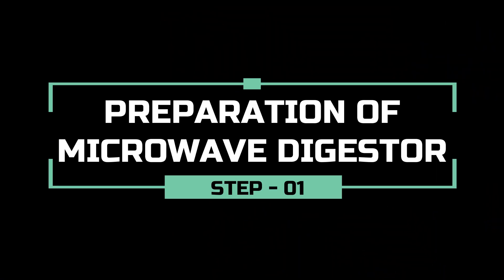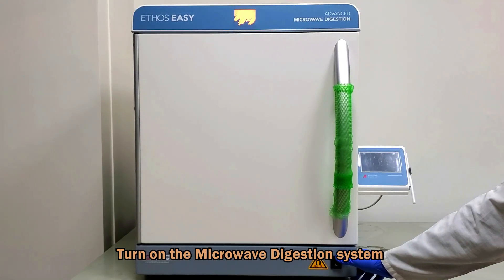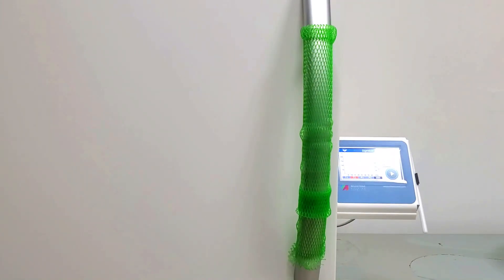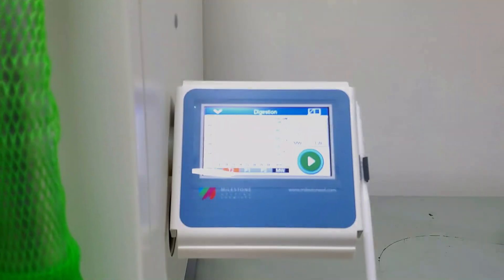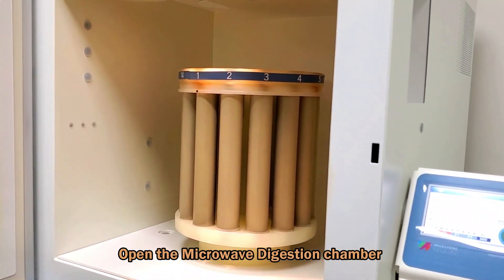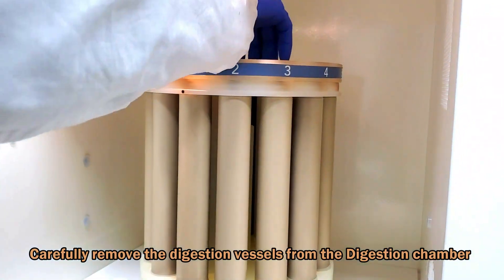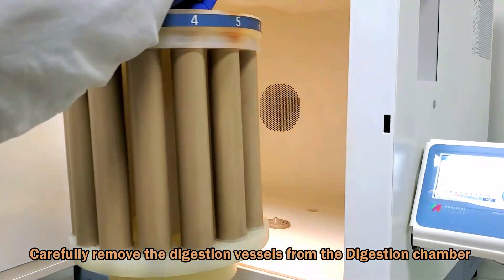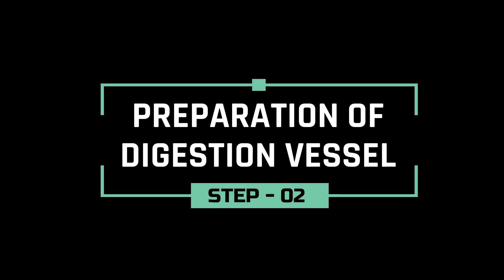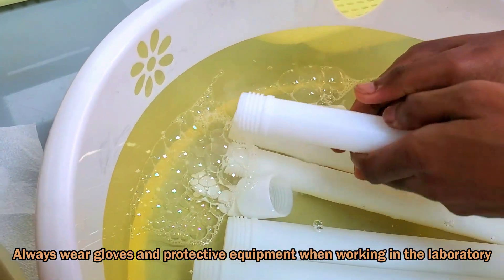The first step is preparing the microwave digester. Turn on the system, open the chamber, and remove the digestion vessels and prepare them for use. Always wear gloves and appropriate protective equipment when working in the laboratory.